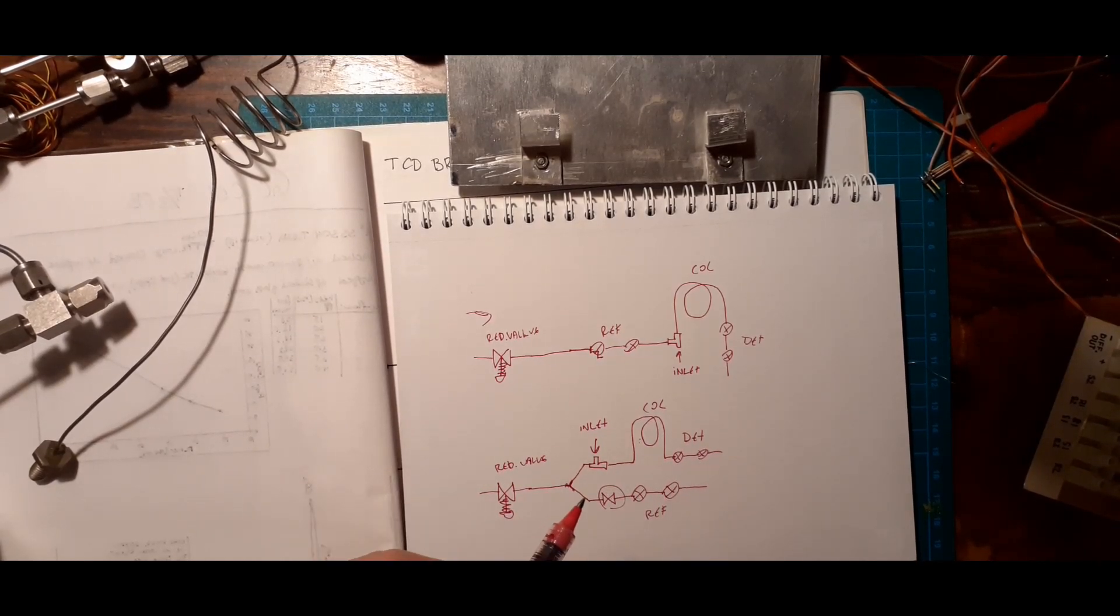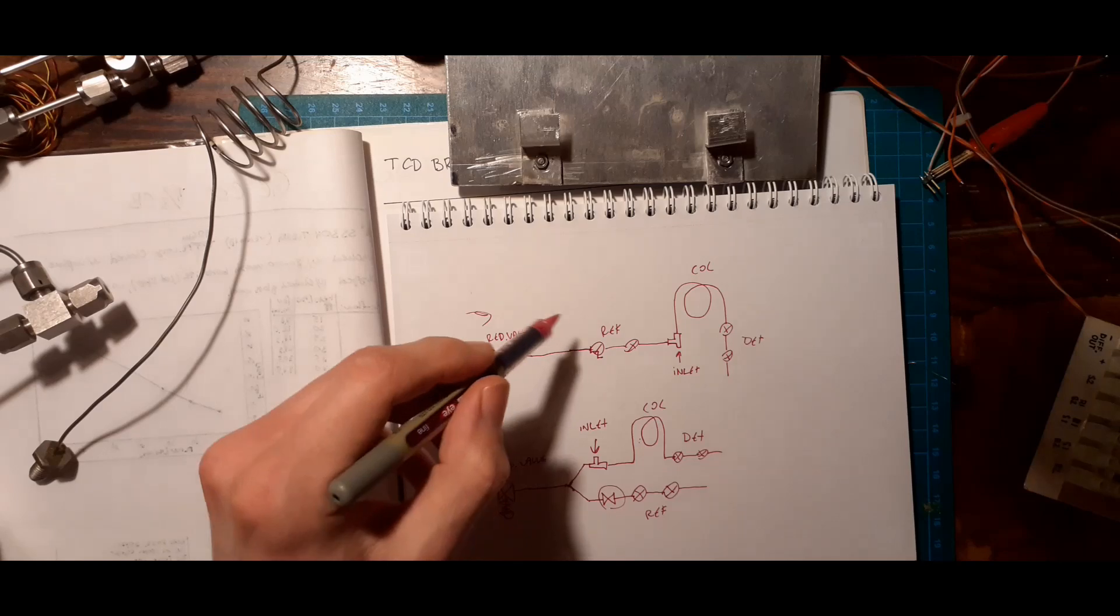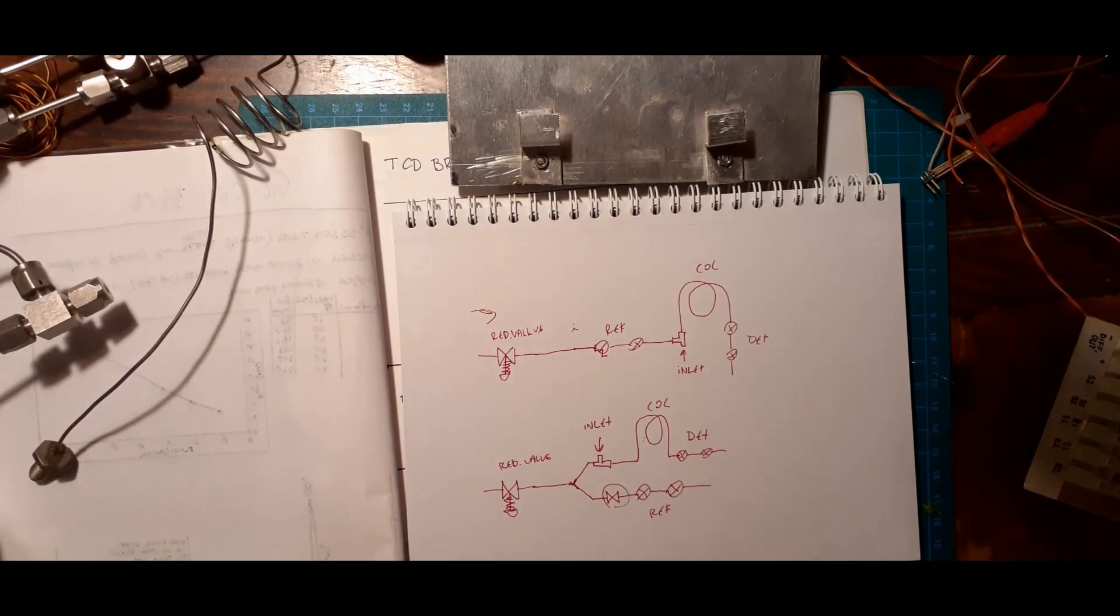I've seen this too. I'm not sure what I think is smartest. You could have an inlet on each, and this would be an easy setup if you wanted to have two columns set up, and you could use whatever column, just as long as you didn't use them at the same time. I don't know, I opted for this one, and that's what you have been seeing.